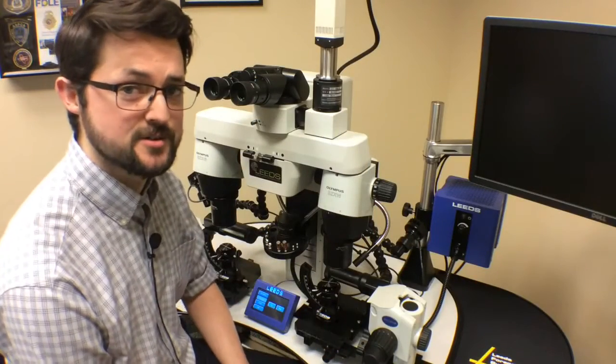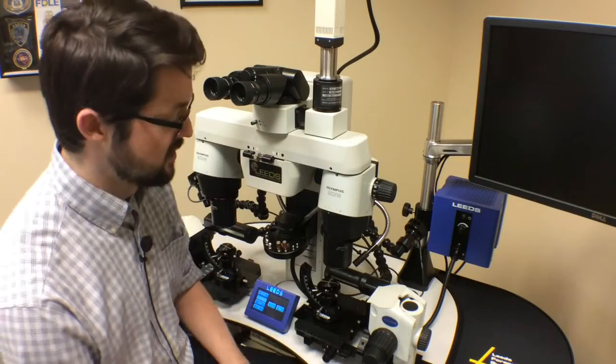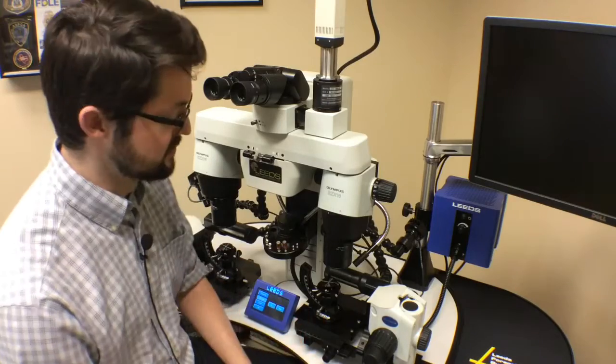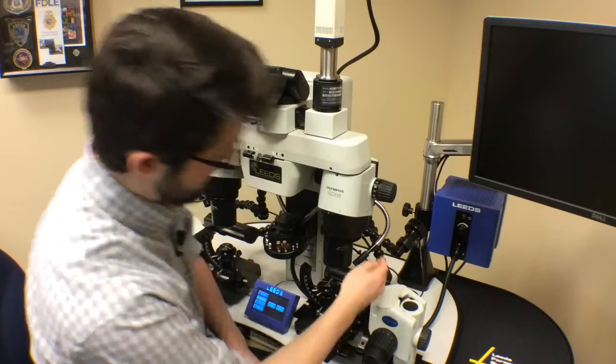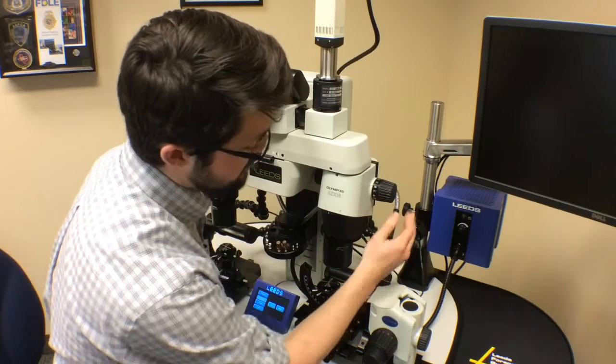On this particular comparison microscope, we have three lighting options — our most popular lighting options. We have our fluorescent quad lamp located here, our LED spotlights, and our fiber optic LED-powered illumination.